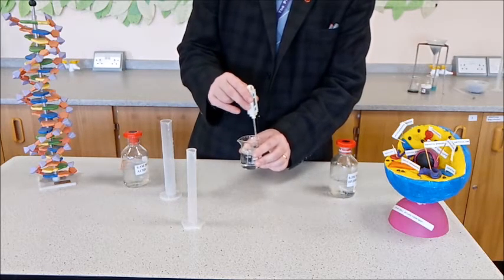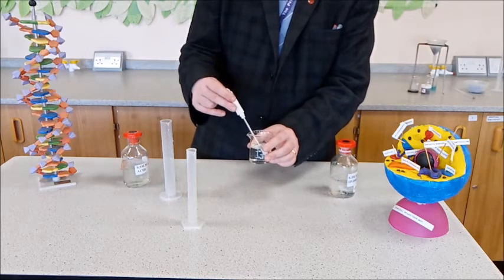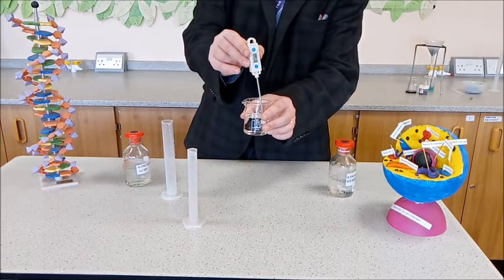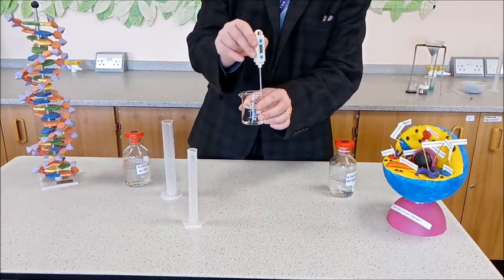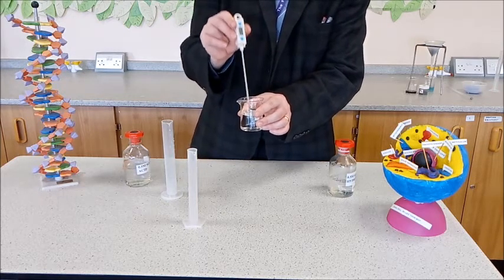This reaction should produce some heat. We can see that it's gone up to 21.5. So the change in temperature would be 3 degrees.